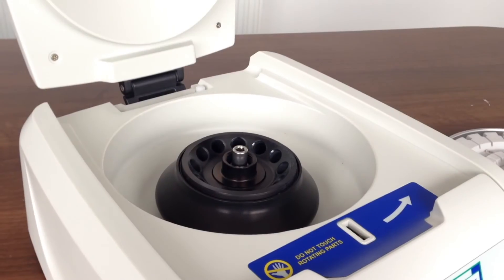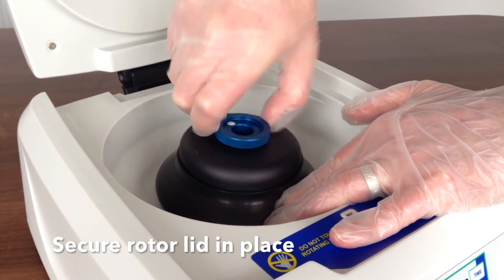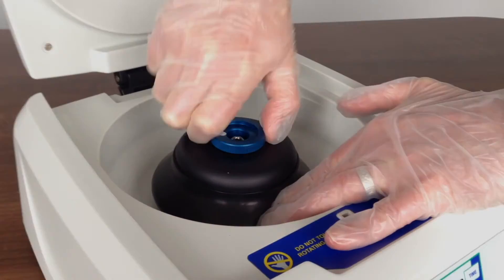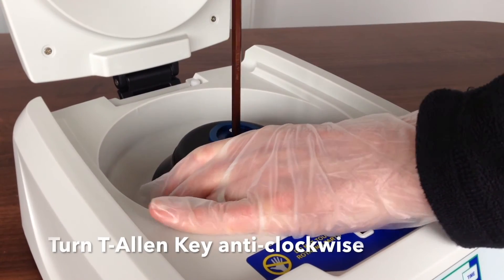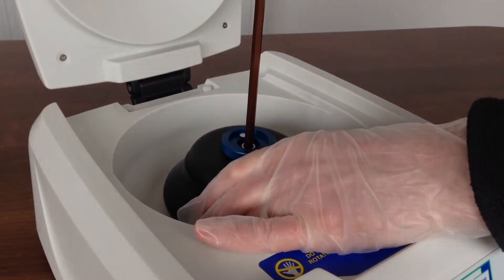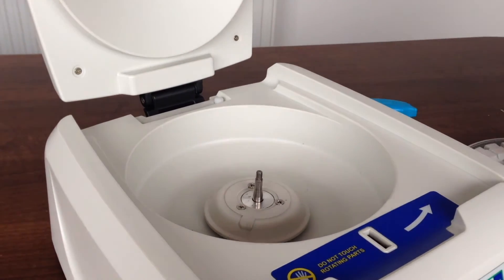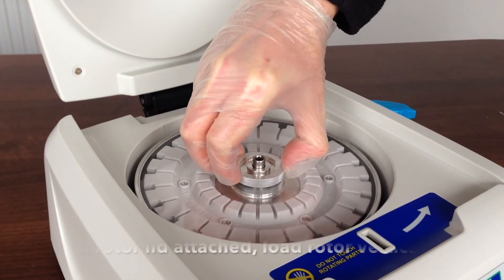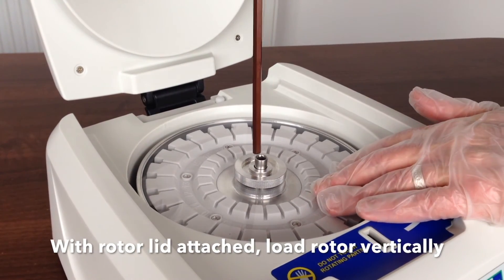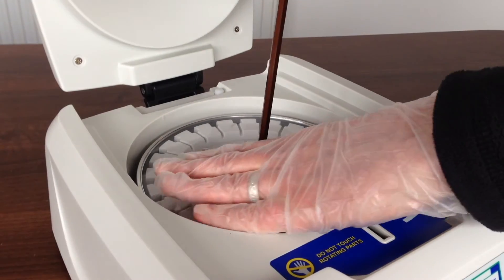The process is the same for either rotor type. Secure the rotor lid in place. Loosen the rotor nut by turning the Allen key anti-clockwise. When the rotor nut is completely loose, lift the rotor vertically. With the rotor lid attached, load the new rotor vertically. Secure the rotor nut by turning the Allen key clockwise.